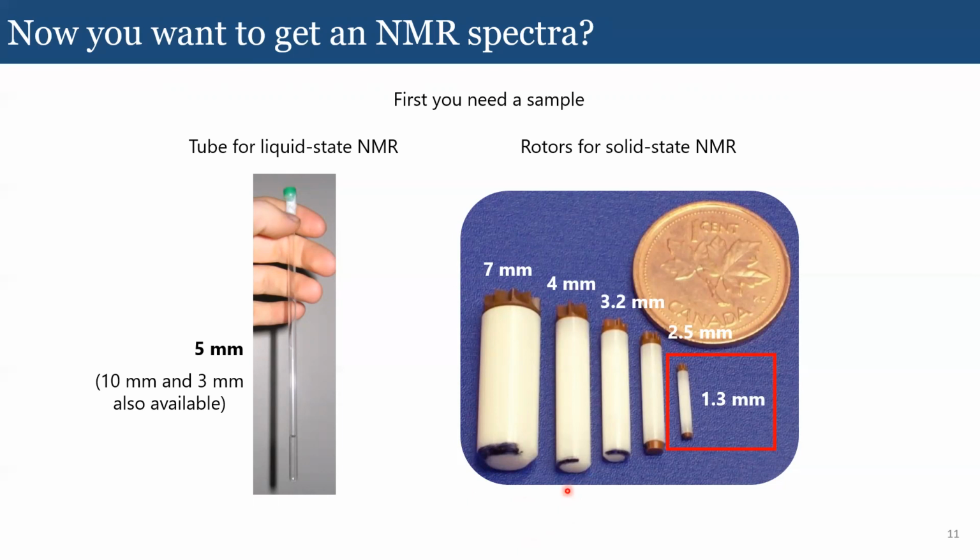So it's in kilohertz, not turns per minute. So it's already quite fast, but still not that fast when you compare to 1.3 mm rotors that can reach 60 kilohertz. So yeah, that's what I meant by depending on the system and type of application. I hope that answered the question.